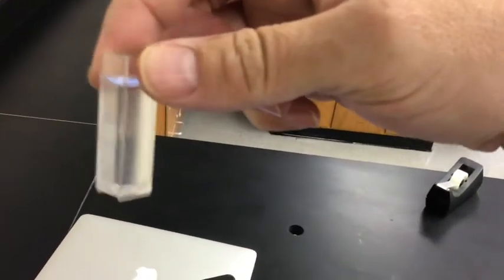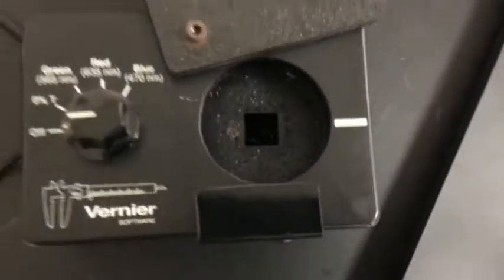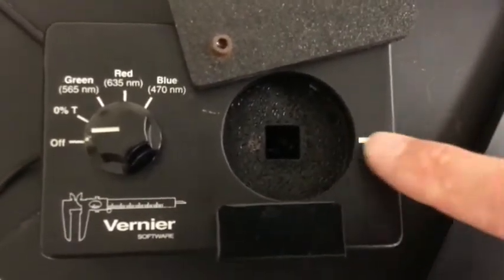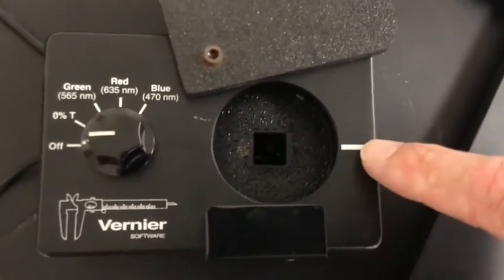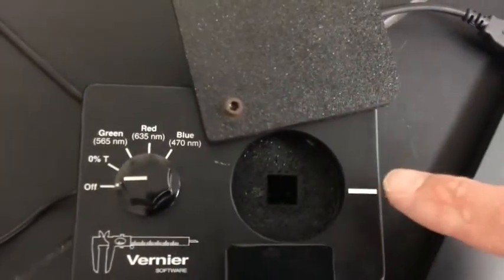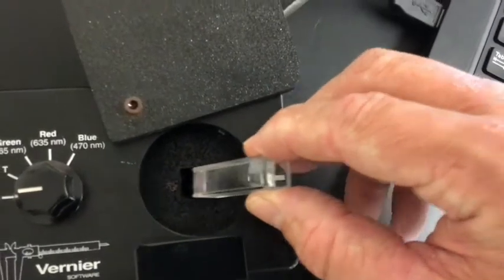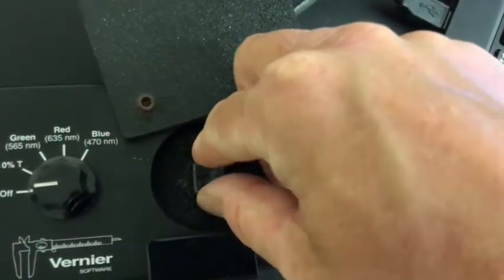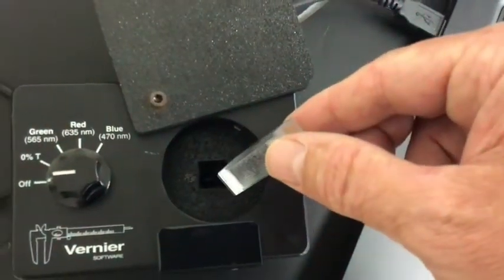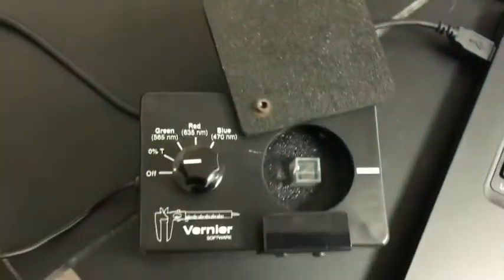There are frosted sides and clear sides on the cuvette. Looking at this device, you can see lines going left to right — that tells you where the laser is going. You want to make sure the clear sides are in the path of the laser, and the frosted sides are oriented up and down. So the clear sides go left to right, and the frosted sides are up and down.